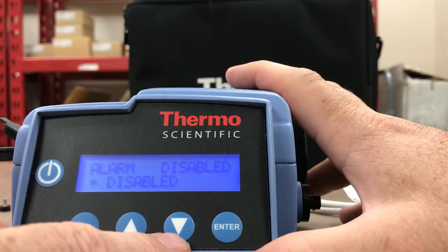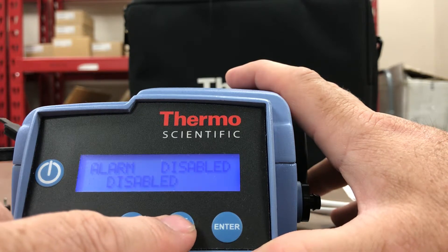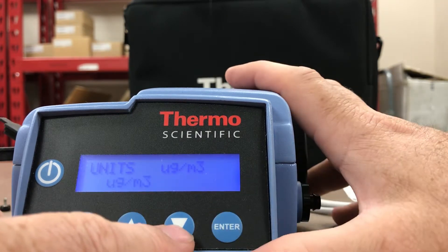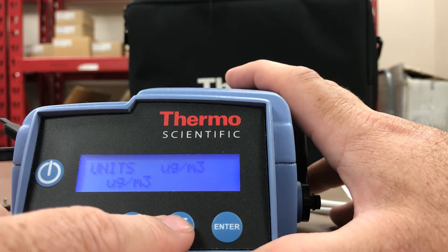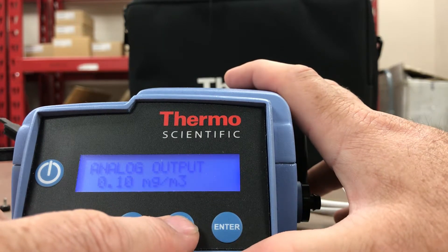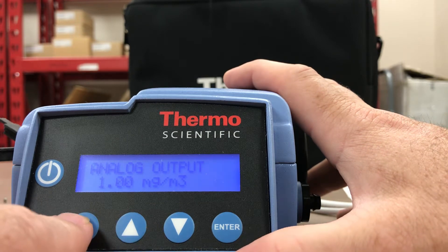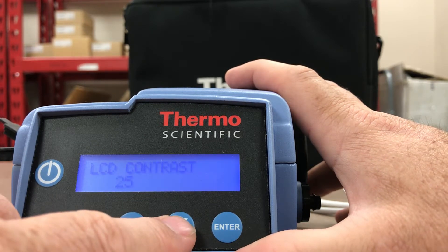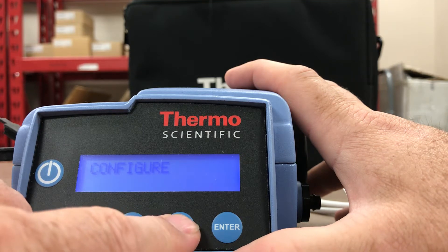Relative humidity correction is disabled. There's also an alarm feature: disabled, instant alarm, short-term event level alarm, and disabled again — we'll leave it disabled. Units: micrograms per cubic meter and liters per minute. Analog output is disabled, but you can have it enabled. LCD backlight is enabled so you can see it on bright sunny days, and you can also adjust the LCD contrast on this unit.